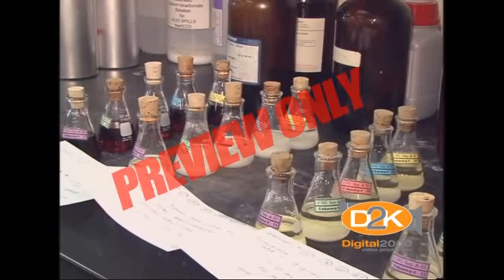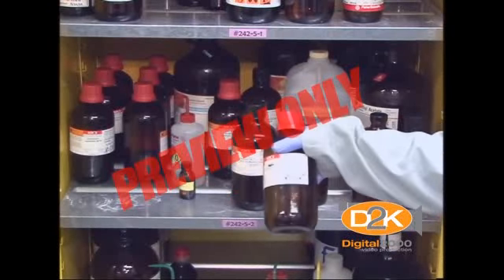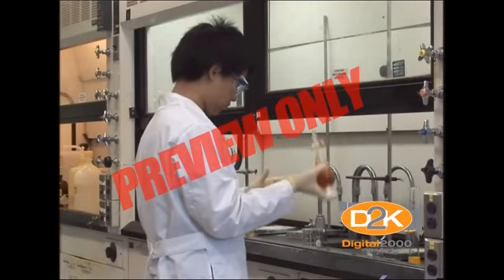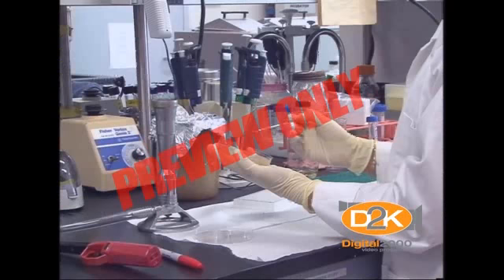The three types of engineering controls are substitution, ventilation, and isolation. Chemical substitution means replacing one chemical with another less hazardous one. This is done to reduce the safety and health risks of a procedure. The purpose of equipment substitution is to reduce the danger of equipment use.